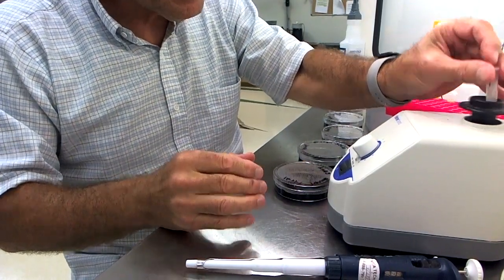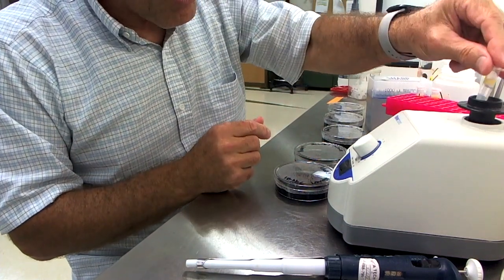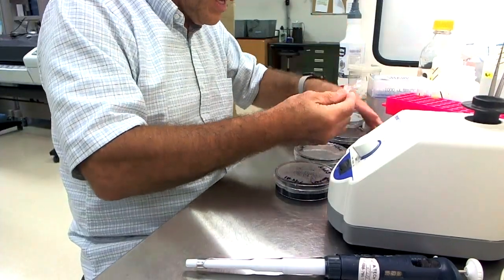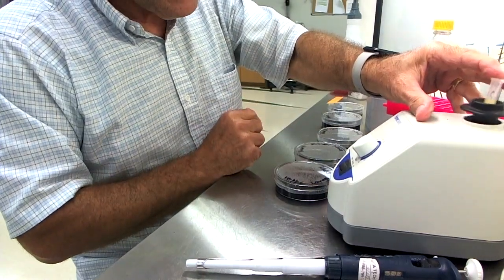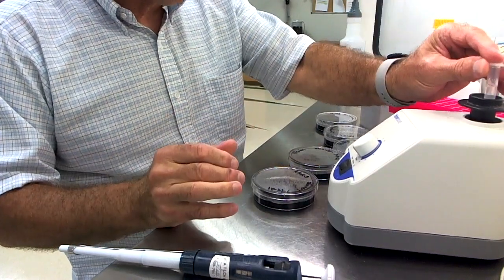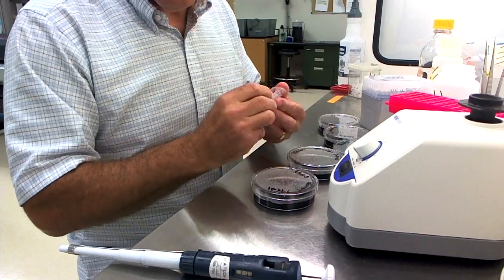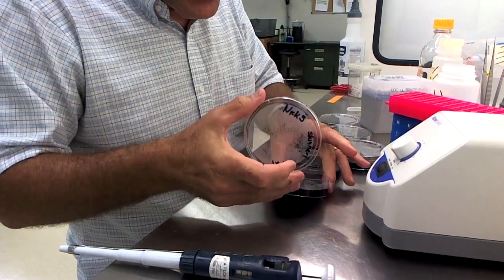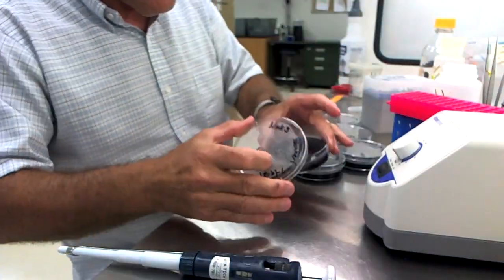I'm going to vortex the seed to resuspend them and then plate them out. I'll do that with all the different seed lots. I have all my plates lined up here and labeled as far as the seed lots go so they won't be confusing. This is the last seed lot — I'll plate it out. The next step is to make sure the seeds are distributed evenly over the dish, and they are.